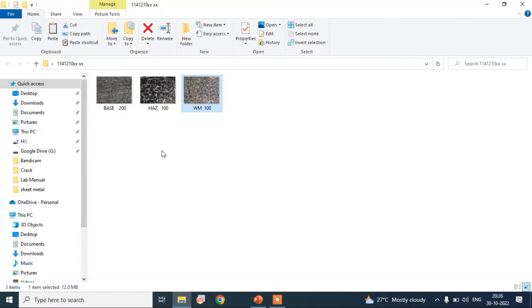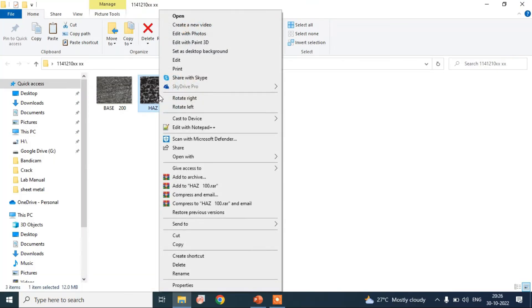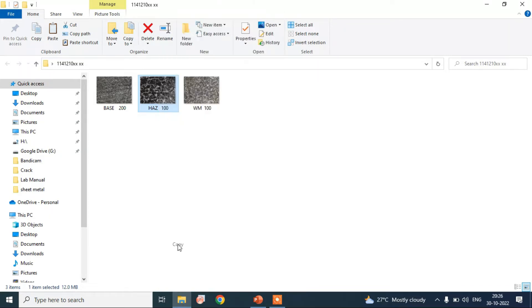Then the heat affected zone image has a magnification of 100x.